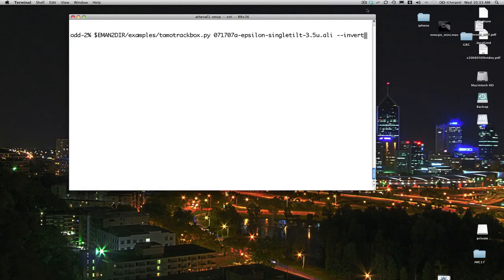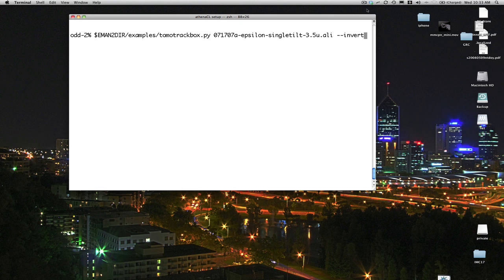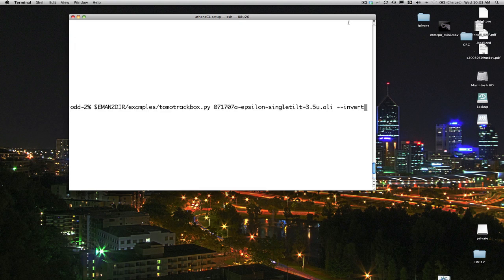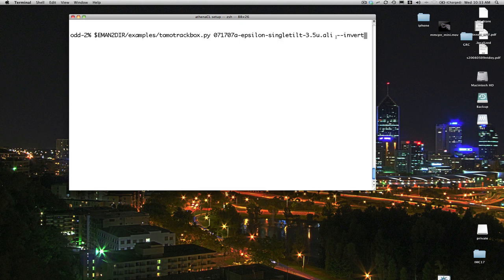Hello, welcome to this quick demonstration of the TomoTrackBox program. TomoTrackBox is an experimental program in EMAN2 designed to help you explore tomographic tilt series. You'd normally use it with an aligned tilt series as would be produced by, for example, iMod, but technically you could use it with roughly aligned tilt series directly from the microscope as well. The program is new, it's still experimental, so it's not part of the binaries directory. When you want to execute it, you have to find it in the examples directory like this.